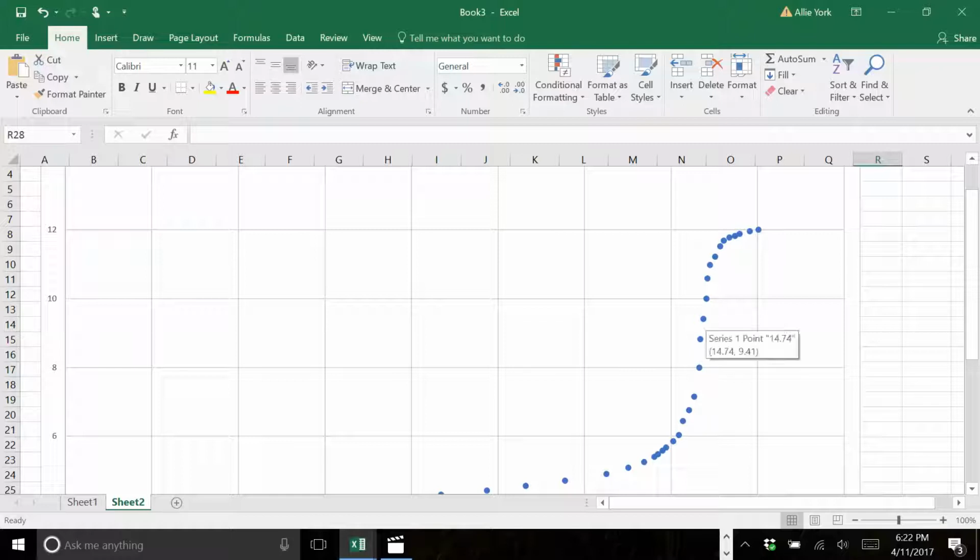But if you see that you move up more, if we add 0.06 mils, it goes up by 0.6 pH units. So this one has the most drastic change. So we're going to assume that this point here is my equivalence point. So go ahead and pause the video and find the equivalence point in your graph.